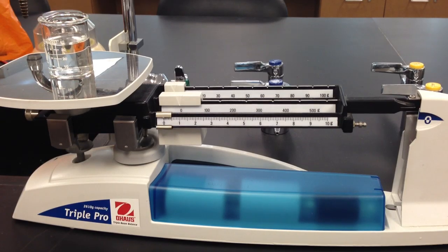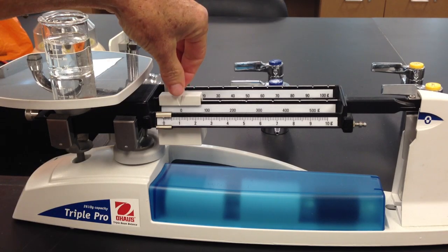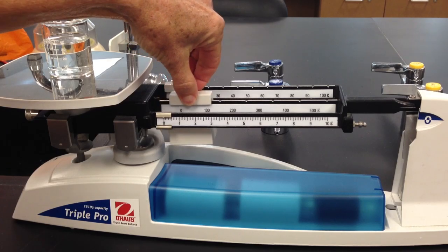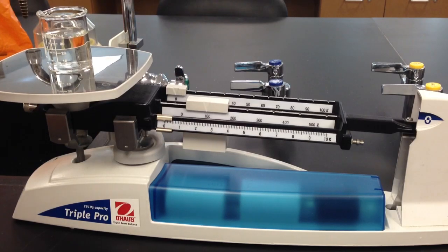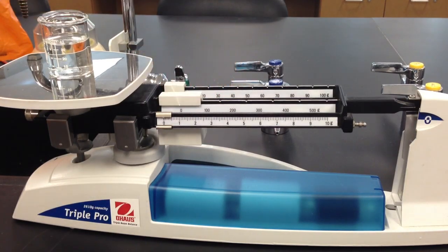We put our beaker on the platform and need to determine how much it weighs. Start with your heaviest beam, the hundreds beam, and move the weight to the next groove, the 100 gram mark. We see that's too much, so the beaker does not weigh 100 grams. We're going to move it back to zero.